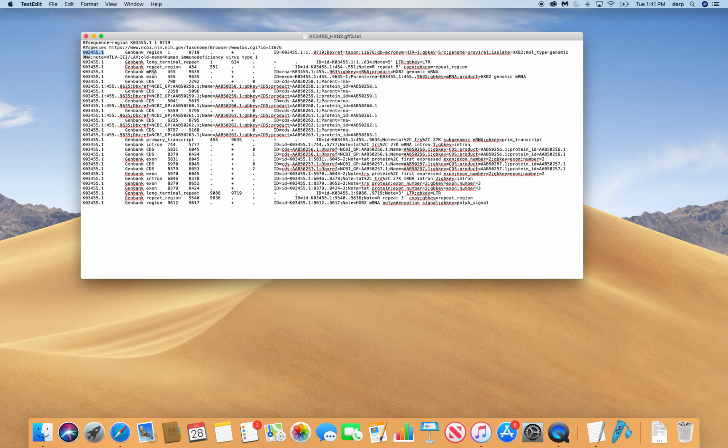And these are all important descriptors to a gene browser or a program that can be used to look at this information, which we will actually use in a future video to be able to see different features of HIV, to make some graphics that look like some of the things that we were looking at in the HIV sequence database. So the HIV map. This information is one way of getting to that type of pictorial description. We have start and stop points relative to different features in HIV. These are analogous to what we would be seeing in the compendium, except each sequence winds up having its own slight variations to those.